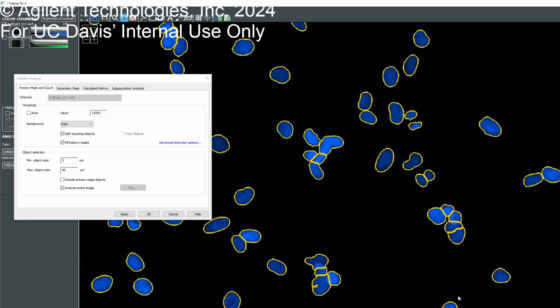So you see the difference. Now it knows where the signal is and the background is, and it's going to do a much better job. It knows what cell size to look for, and it's going to try to split between them.